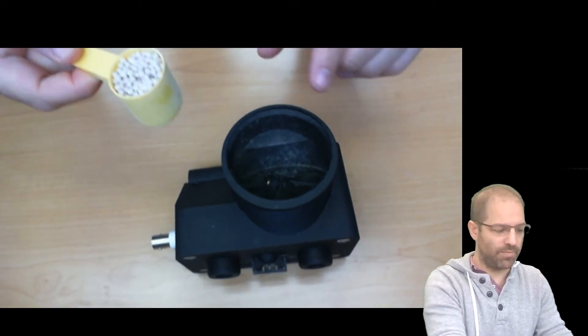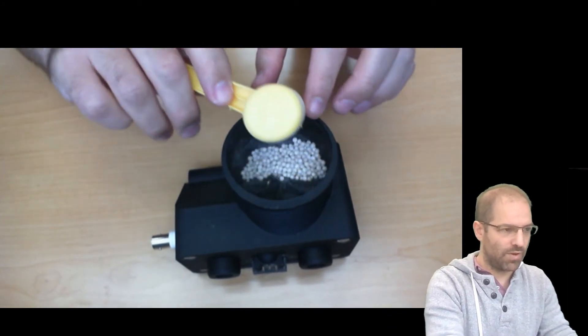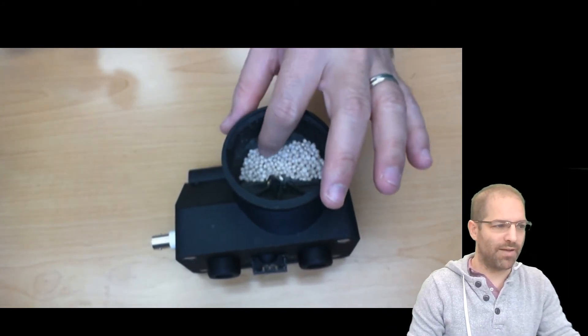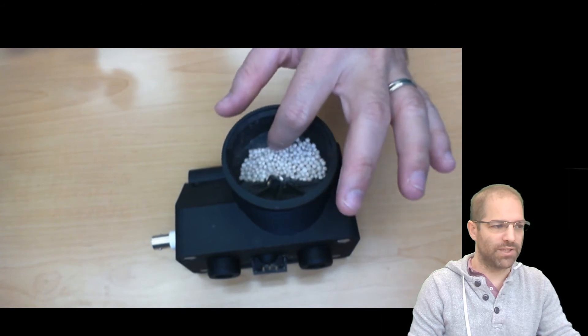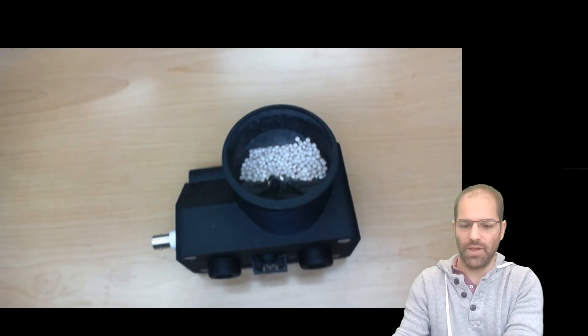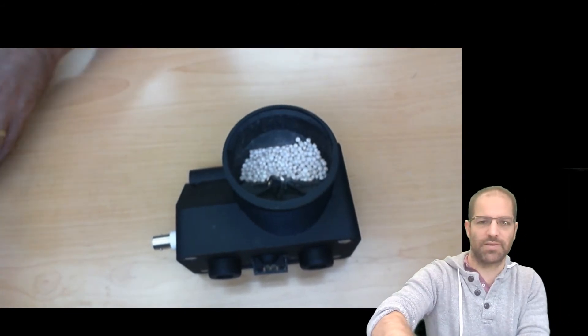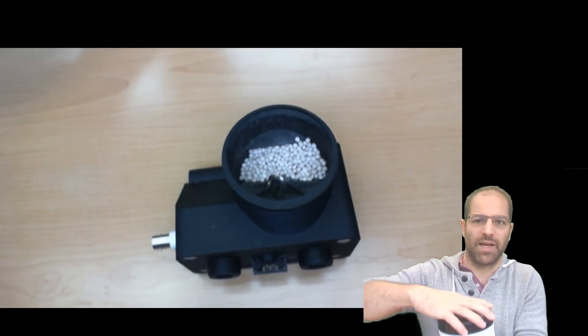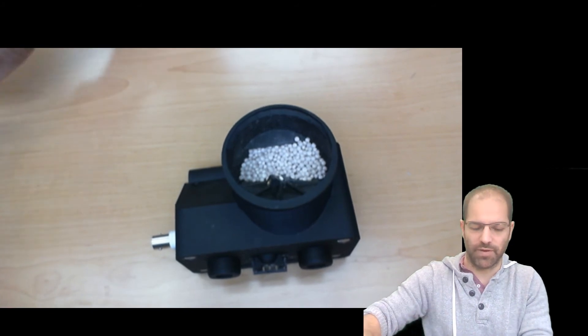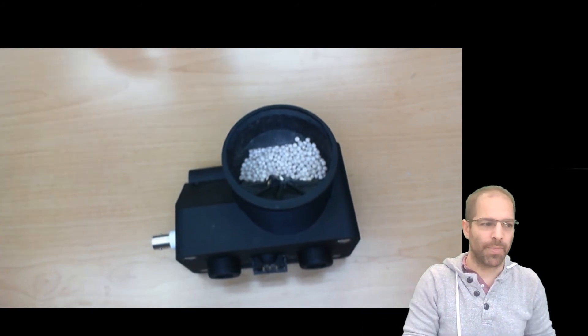When you fill out FED3, you only fill up the hopper about halfway. There's a little ridge here that says max, and that's so that the pellet dispensing mechanism doesn't get jammed if you overfill it.